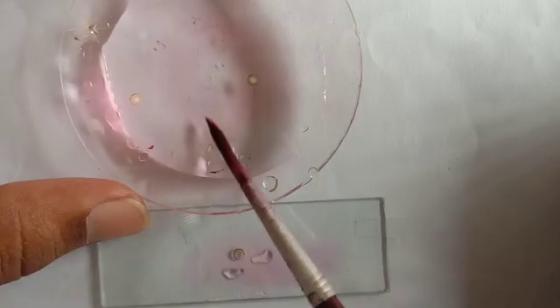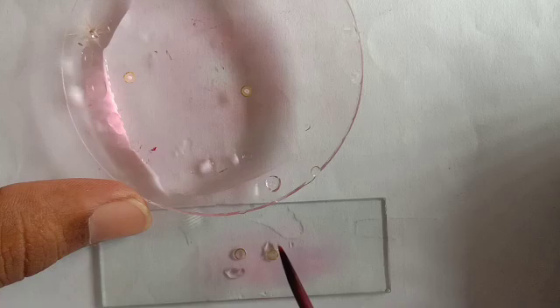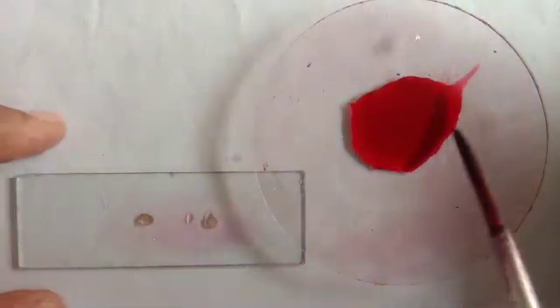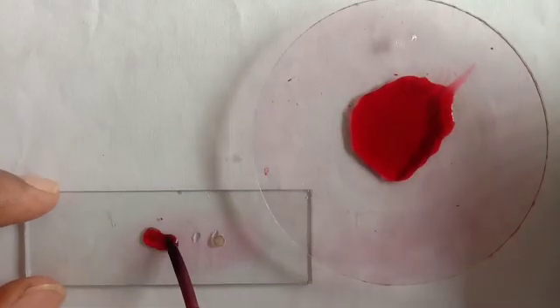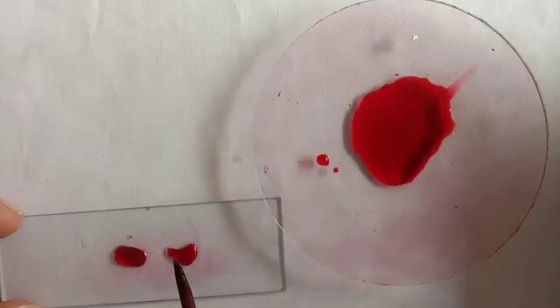You have to select a thin section. Now we are staining them with the help of safranin stain. With the help of a brush or you can use a dropper to stain them. Wait for a few seconds.